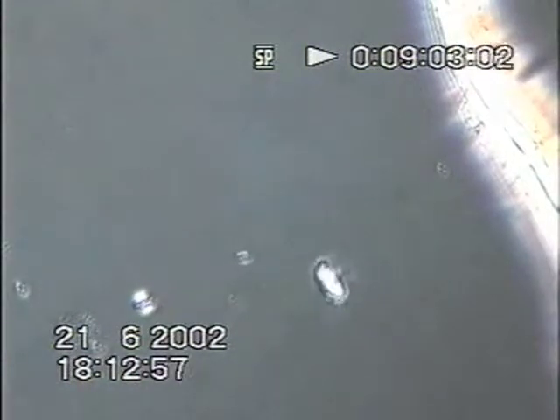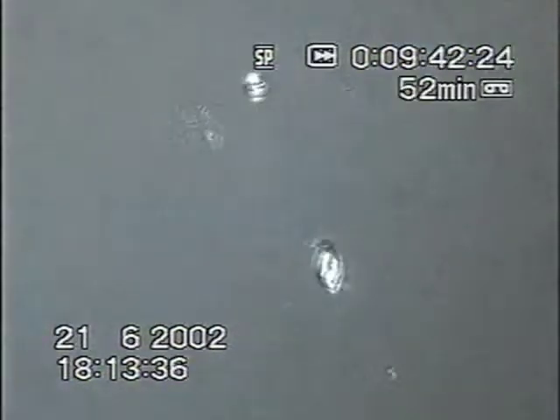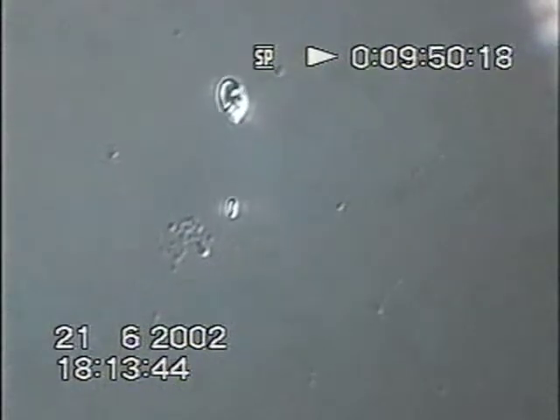This is a drop of rainwater on the 21st June. Just one drop. It's full of motile organisms. Here we are. Looks like two having fun almost. Here we have lots of pollen grains in this. That's rather interesting. I think it's got a tail.